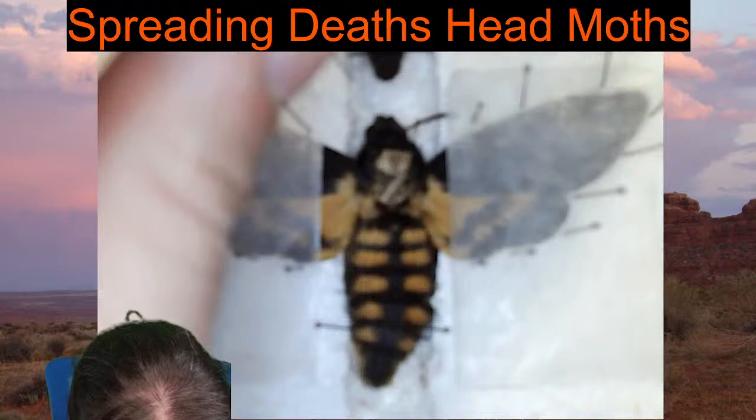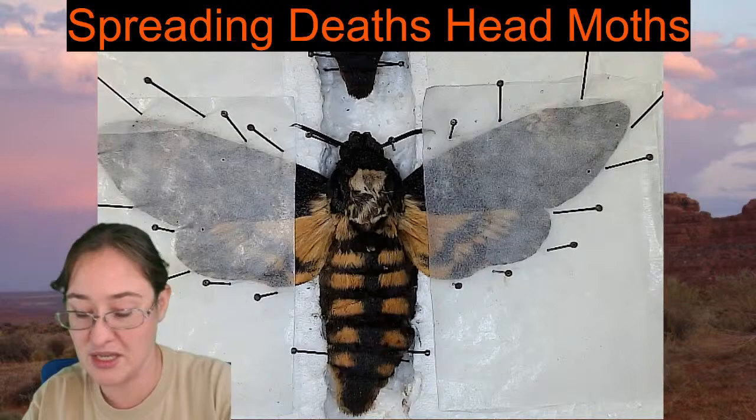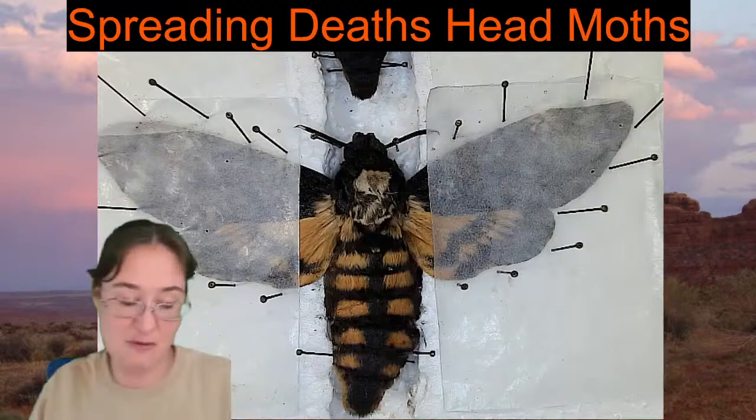And I find as long as the antenna are up and mostly parallel with the angle of the front wings, then they look really nice when they are taken down. We will be going ahead and taking down these death's heads too at some point, so that's fun.